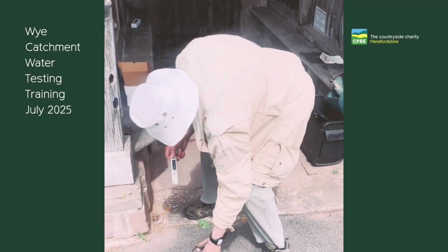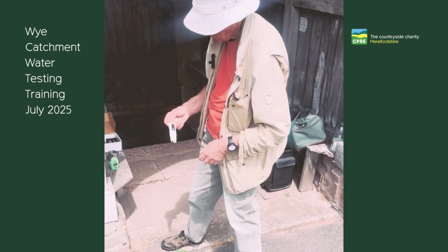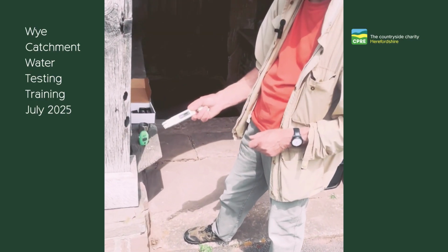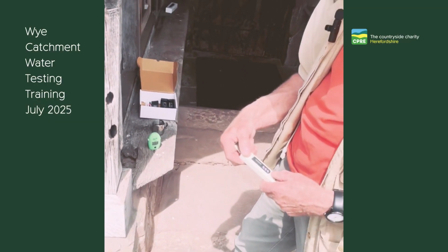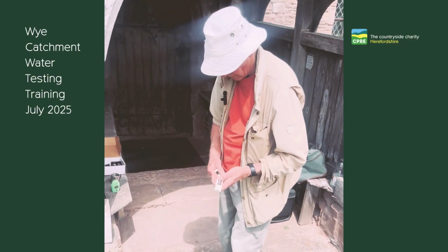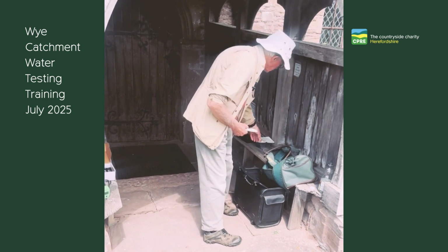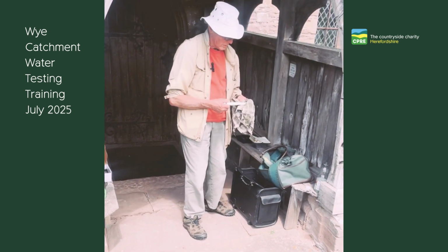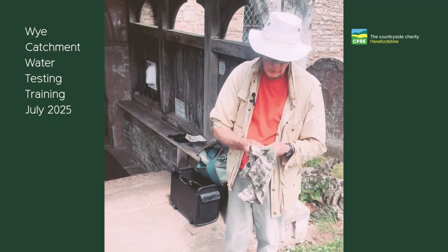And now we've got electrical conductivity. We press the temperature button and it's exhibiting 20.1, which is the temperature of the water. That's unusually high, of course, because this water has been standing in a bottle for a long time. And it would be rather unusual to have a temperature in a stream of over 20 degrees.